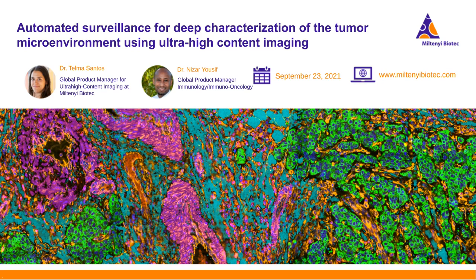Great, thank you, Nizar. Our next question, what is the largest field of view and what is the best resolution possible? Cellular, subcellular? Lots of questions there. Hi, I will take care of this one now. The field of view is defined by our camera, but we actually can do several regions of interest with a lot of fields of view. Our field of view is about 500 by 250 microns, but there is no limitation on the amount of fields of view or ROIs that you can do.